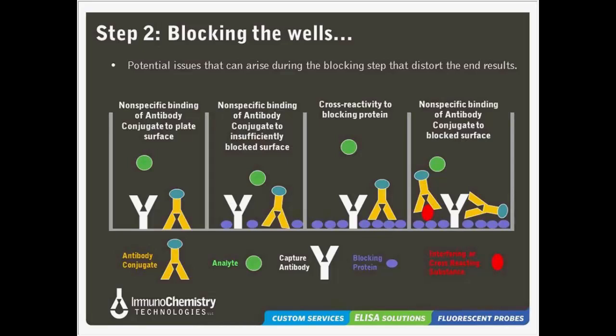and it just sticks to the IgM that's stuck to the plate. So when you look at your zeros, instead of zeros, you got a reading of like 3.0 or something, and it was because the signal generating antibody is binding to that IgM that decided it wanted to stick to your plate. Now, there are treatments for that, and one of our buffers actually addresses that, where we try to convince the sample IgM that's sticky to not stick to the plate surface.